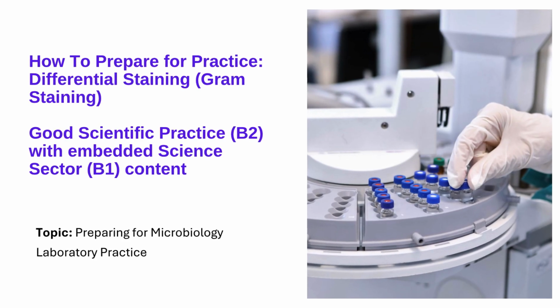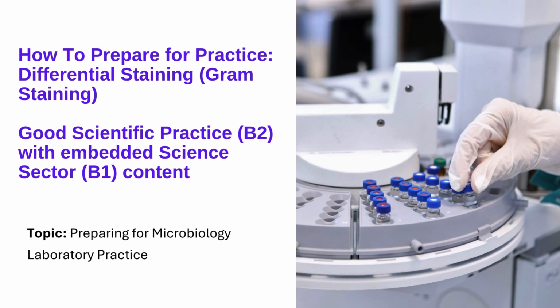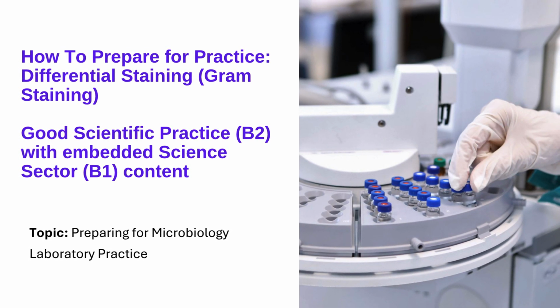Before any scientist carries out a microbiology test, they must prepare themselves, their equipment, and their laboratory correctly. Practical activities in T-level science provide an excellent opportunity to teach students not only the scientific technique itself, but also how to prepare for practical work safely and professionally.